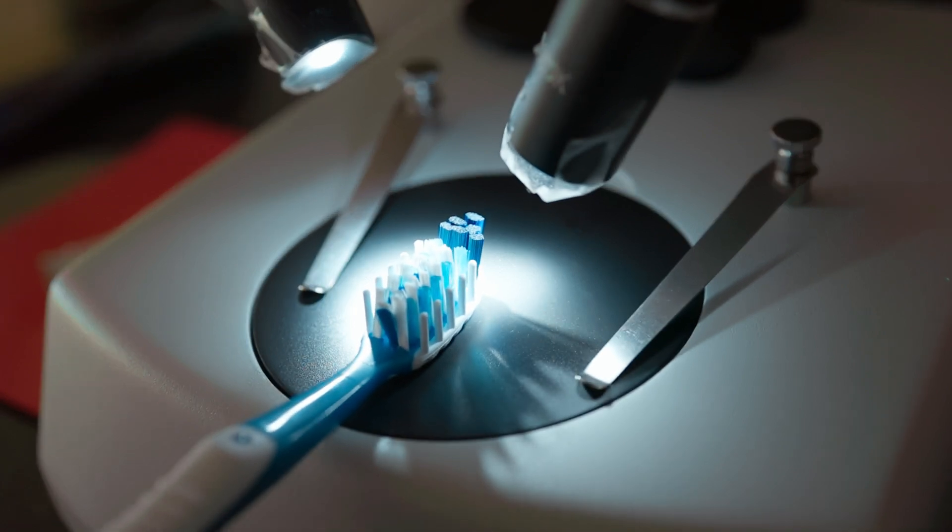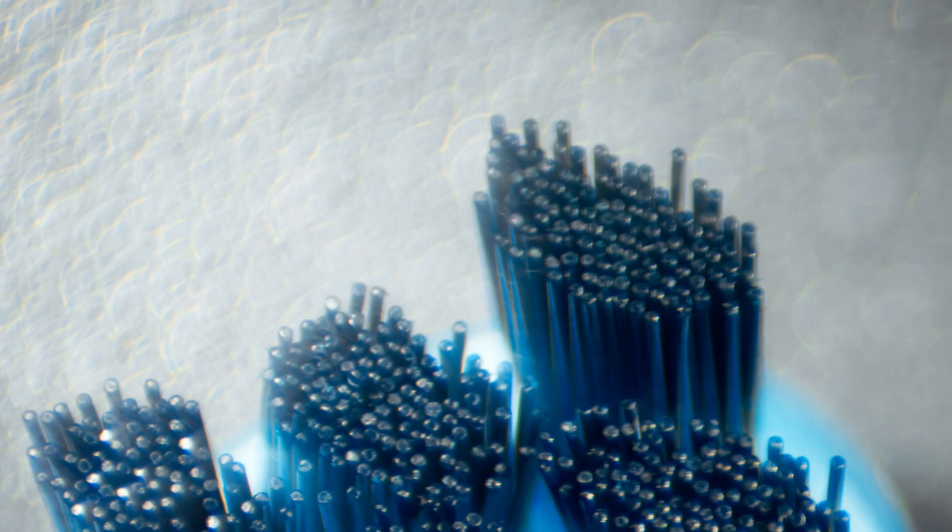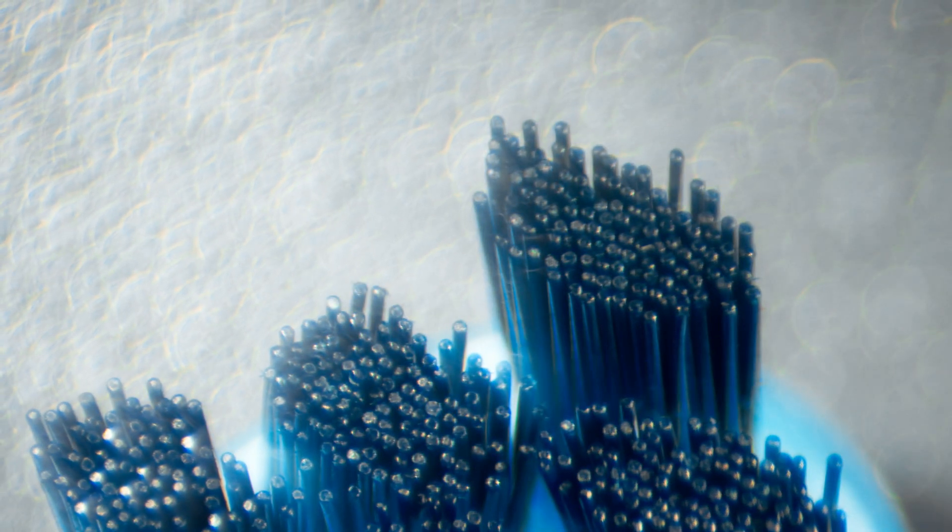First I'm going to show you a brand new toothbrush. We'll focus on the toe of the toothbrush. As you can see all the bristles are up and even forming the brushing plane.